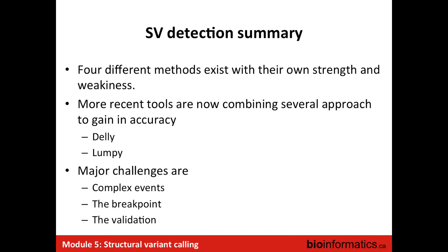And the major challenge when we do SV is to understand complex events, because you will have several sets of calls in the same region, and to really understand what you have is sometimes really, really hard, and you cannot really resolve that. It's also hard to find the real breakpoint, because if you want to validate your data, you need the real breakpoint to design, for example, a PCR or this kind of thing.